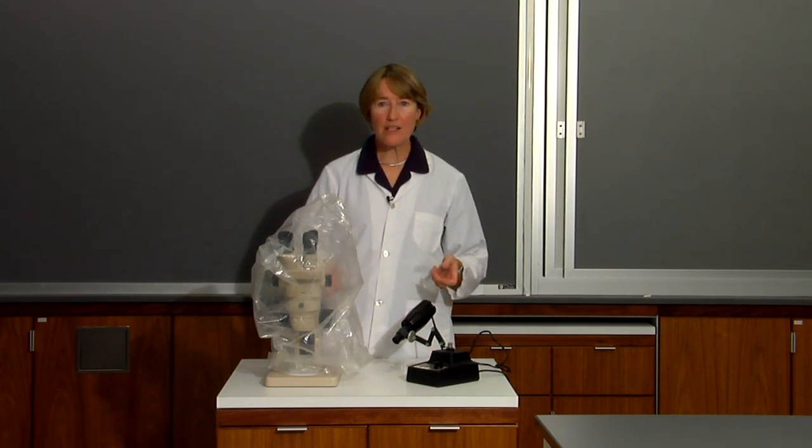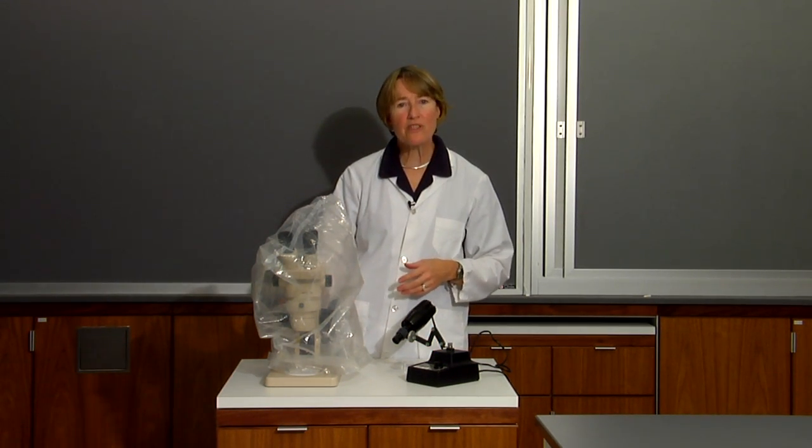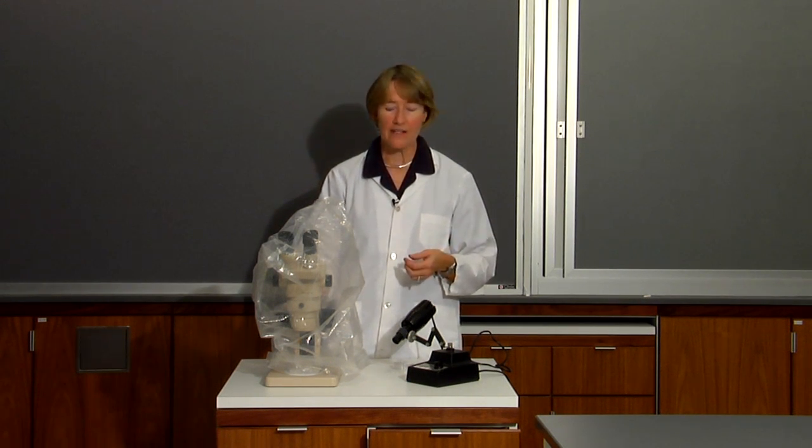This week in lab you'll be using dissecting microscopes. Dissecting microscopes are used for low power magnification when we're looking at things such as parts of insects or small insects, parts of plants, and other small organisms.